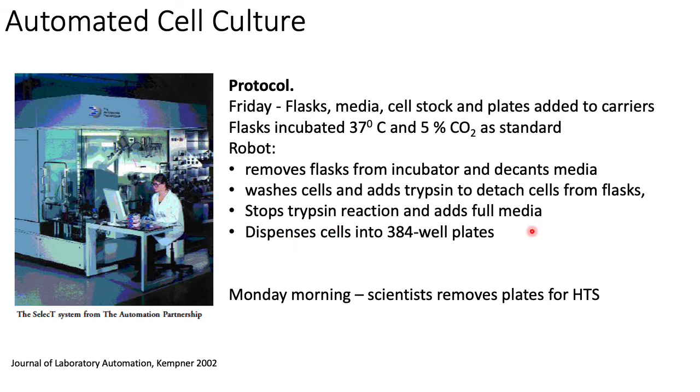Then what the robot does is dispense cells into a 384 well plate, and then it returns the plate to the incubator to allow the cells to attach. They'll grow up over the weekend, and then on Monday morning the scientists can remove the plates for high throughput screening.